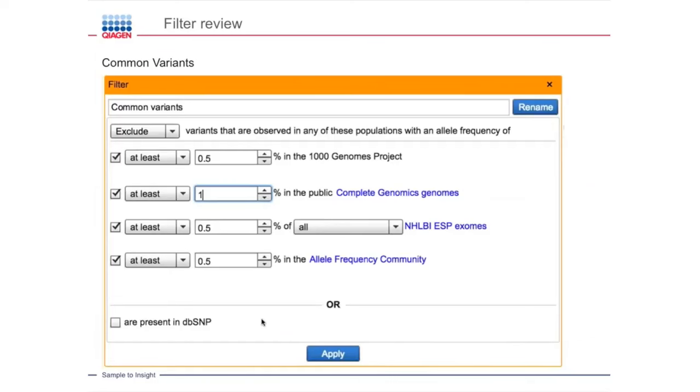So once you have applied a confidence filter, you go down to only variants that you can trust in terms of quality. And then we go on to remove common variants, because very likely if you're looking for a causal variant, it will not be something that's too common in the population. The threshold for how common or rare you would like the variant to be depends on how common or rare the disease that you're looking at is.